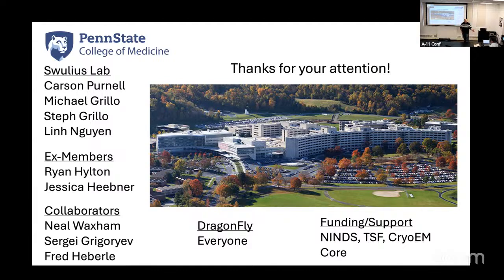So that's why I like to tell people to make your own models, because it's like running a Western blot now. We're not going to go explicitly over using CTS today, but I have tutorials for that as well that I can share with people. And you can make these synthetic tomograms in under 10 minutes. So it's pretty fast turnaround if you want to play around with it.